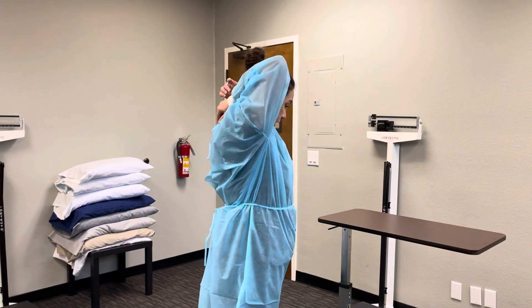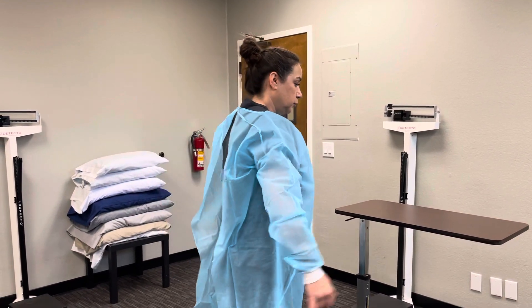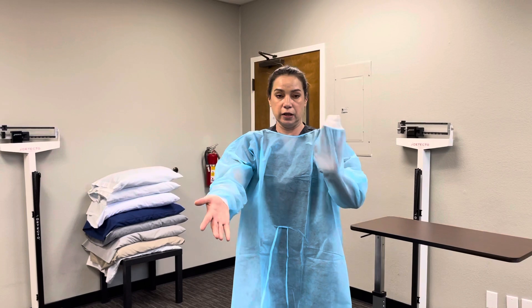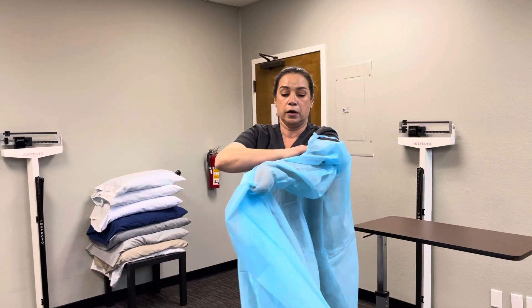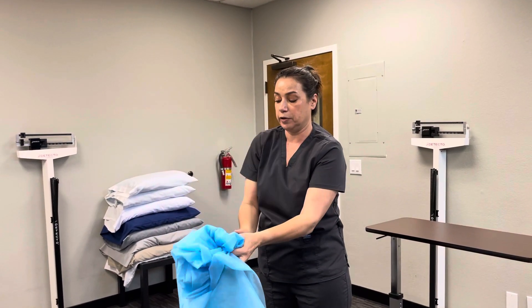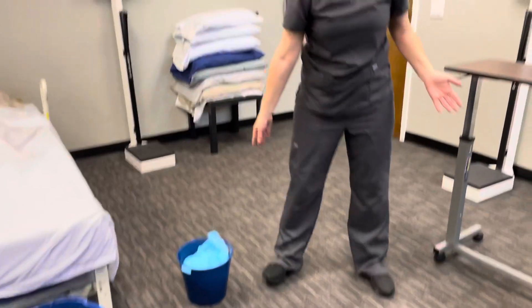Then I'm going to remove my gown. I'll slip fingers underneath, making sure not to touch the outer surface, then reach up and grab the sleeve and remove the gown. I'm going to roll it into itself, making sure not to touch the outside of the gown, and throw it away in the contaminated area. Then I'm going to wash my hands thoroughly.